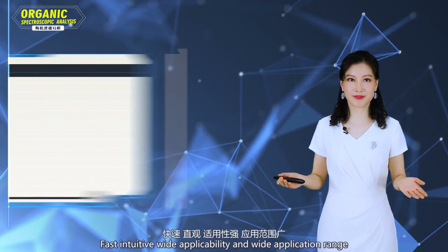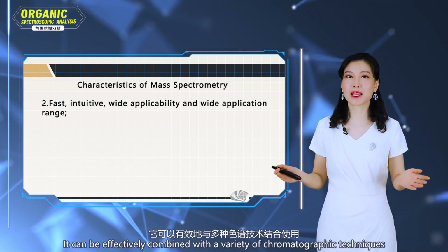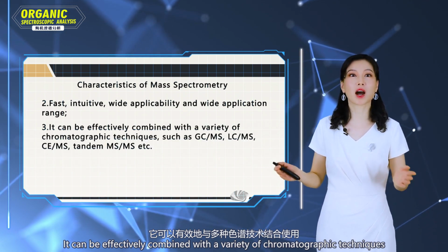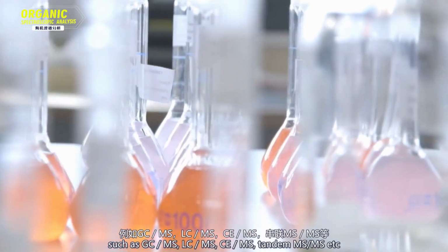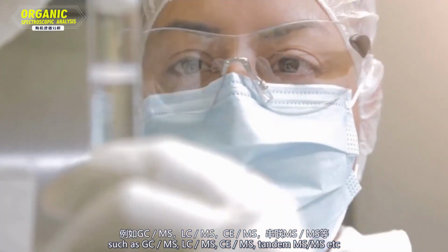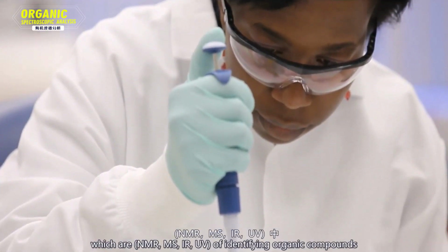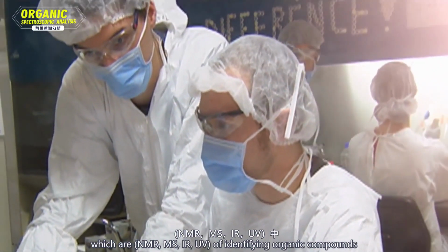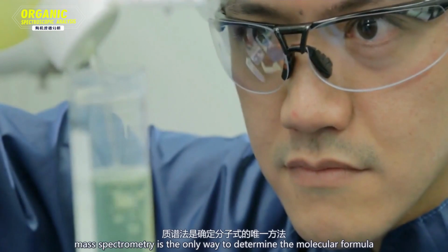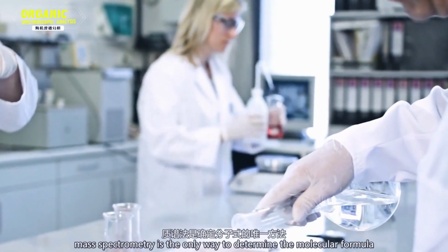Fast, intuitive, with wide applicability and a wide application range. It can be effectively combined with a variety of chromatographic techniques such as GC-MS, LC-MS, CE-MS, tandem MS, etc. Among the four important means of identifying organic compounds, which are NMR, MS, infrared, and UV, mass spectrometry is the only way to determine the molecular formula.